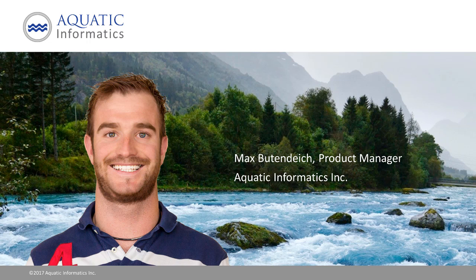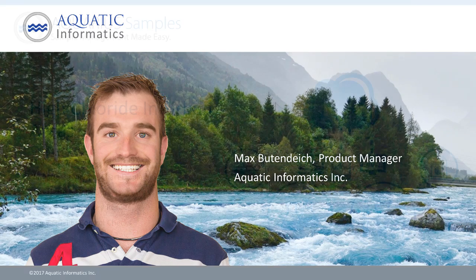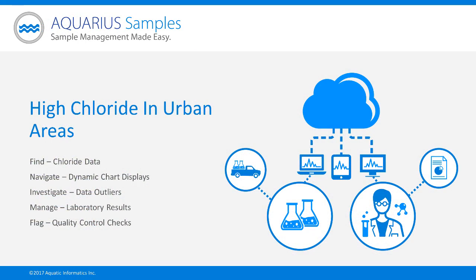We'd like to continue showcasing some of the features of Aquarius Samples and how it can help you solve some of the common use cases that you may be facing. Today we're going to look at some examples around road salt as a simple example and related chloride levels. There's a whole bunch of information in here that we're going to explore. Max, would you like to walk us through? Sure, thanks Alistair. I'll bring that right up.